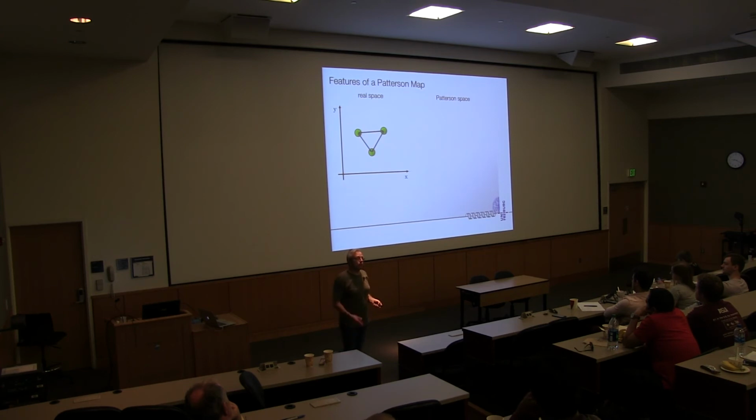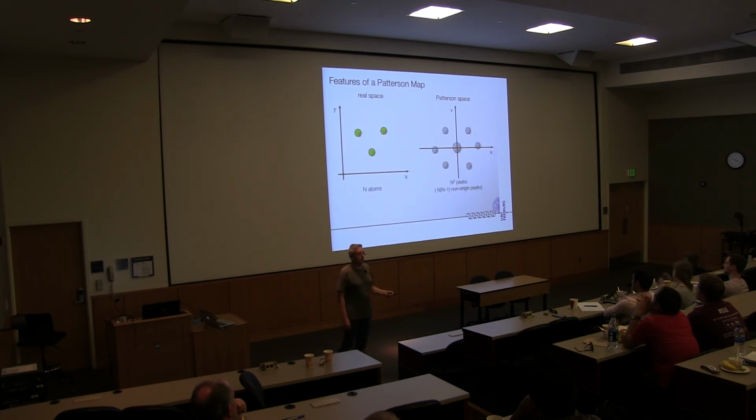And the problem is that, of course, because you don't have an absolute origin in that map, you get all these vectors in the origin of your map. So a Patterson map from these 3 vectors would pretty much look like this. That's what you can calculate.